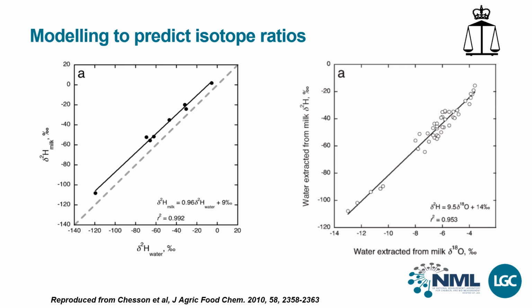Alternatively, we can take a substance that is expected to reflect hydrogen or oxygen isotope delta values for precipitation, measure the isotope ratios in samples obtained from known locations, and fit a model to predict isotope delta values for those of precipitation. This may be useful in geographical origin determinations.